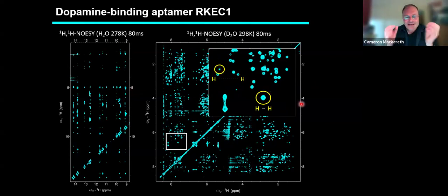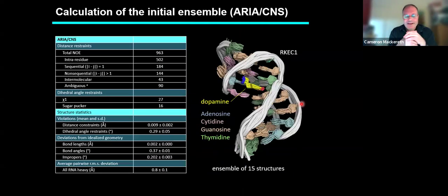And so we do this for as many different cross peaks, we call them, these NMR signals that connect two different hydrogens. And we collect all of them and we make a list, and then we use a program. I typically use one that is perfect for biomolecular NMR structure determination. It's a combination of ARIA, which allows us to use some initially unassigned spectra in the initial stages, so it saves a bit of time and it has more freedom in the type of input we use.